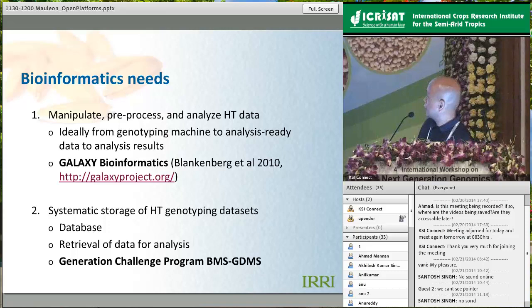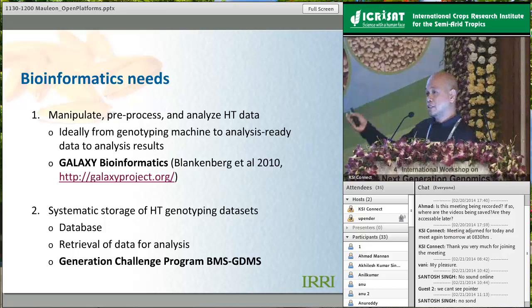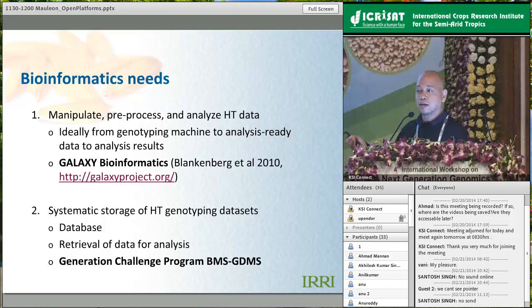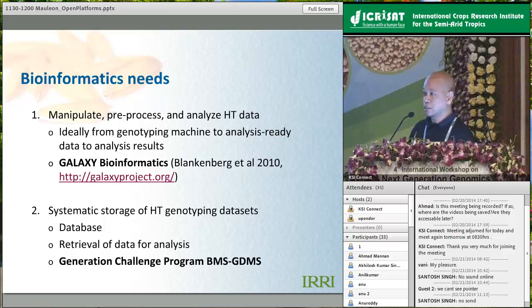Diving into the open source platforms: for the manipulation, preprocessing, and analysis of high-throughput datasets, we identified Galaxy Bioinformatics Workbench as an ideal framework to capture all the software that does these things. Ideally, we want a system that captures raw data as it exits the genotyping machine with minimal human intervention - the more manual steps you introduce, the more likely there are errors. We wanted a system that takes data from the machine and delivers it as analysis-ready data or even analysis results. Galaxy allows that.